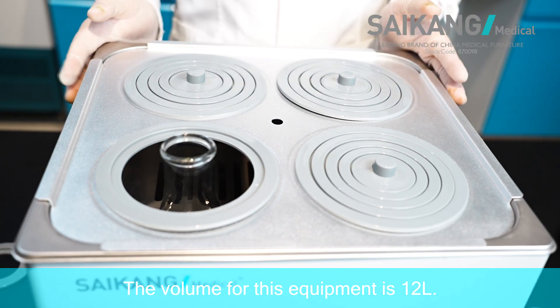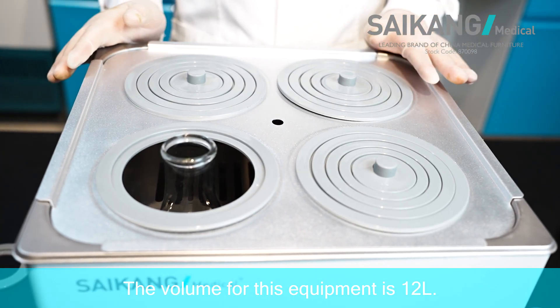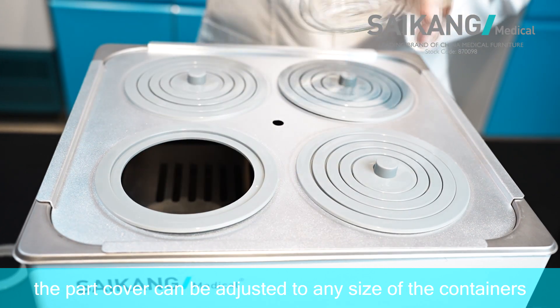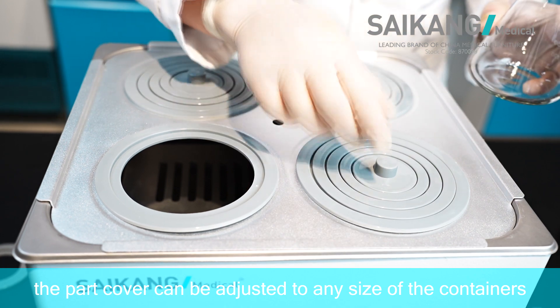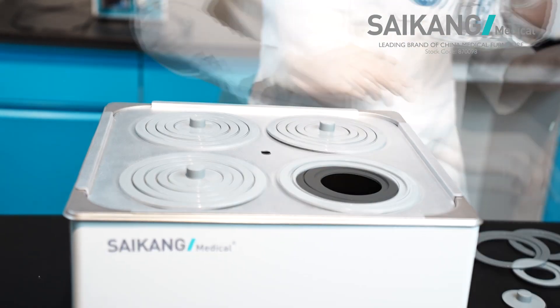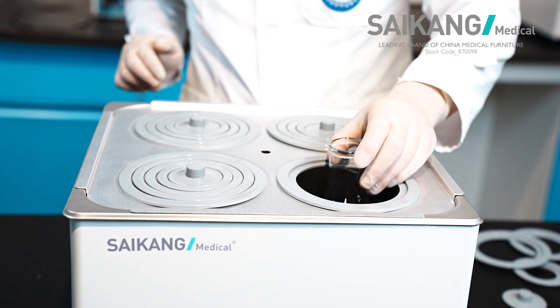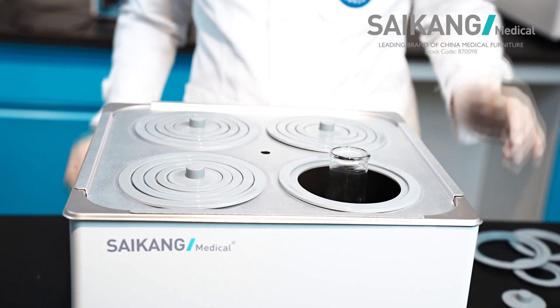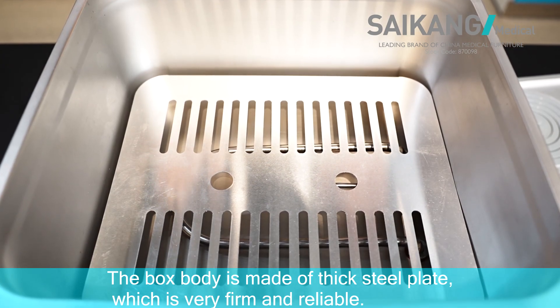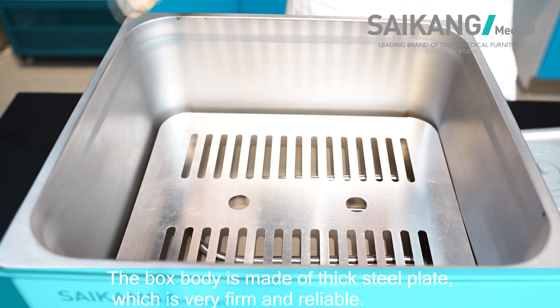The total volume for this equipment is 12 liters. And let's see the pot cover — the pot cover can be adjusted to any size of containers. You can see the box body is made of thick coated low steel plate, which is very firm and reliable.